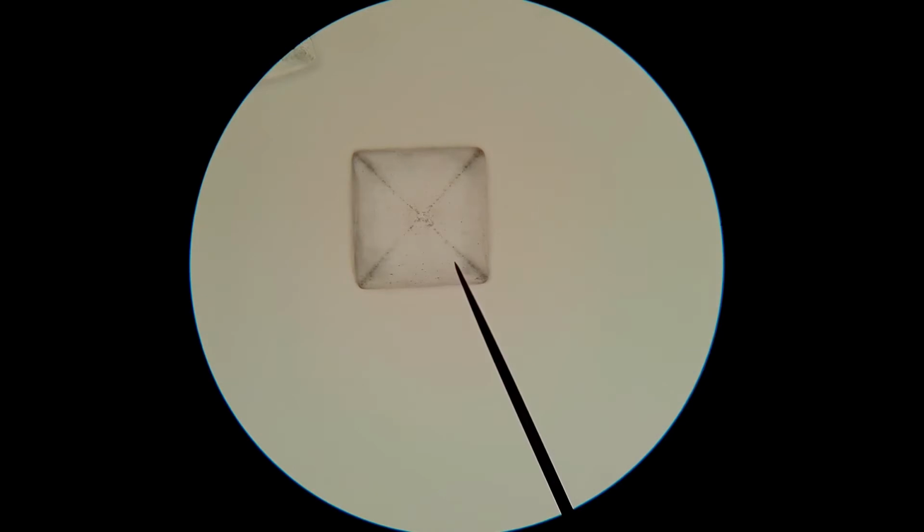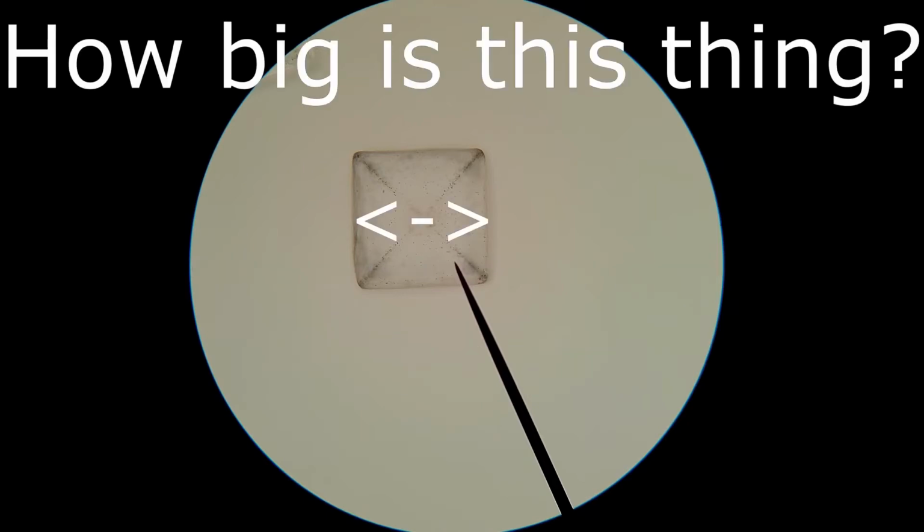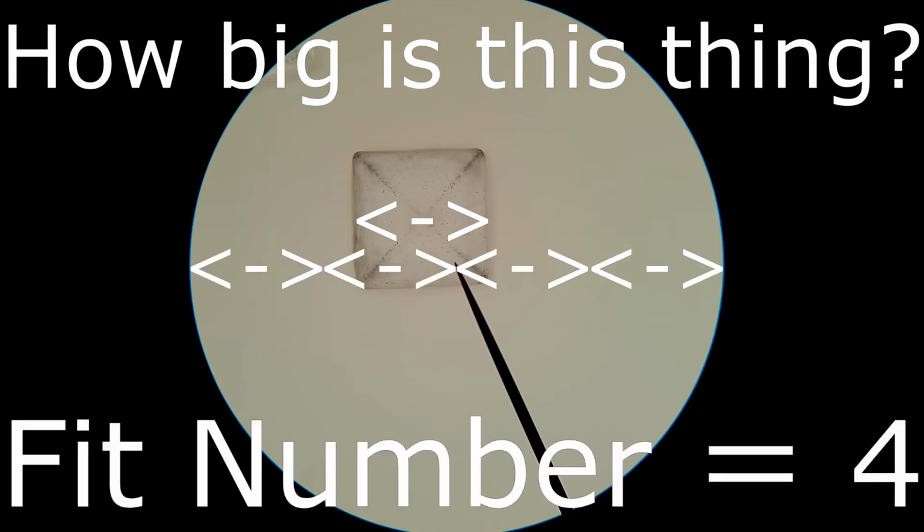For example, this is an image of a salt crystal under medium power magnification. That means our field diameter is approximately 1,720 micrometers. If we want to estimate the size of the salt crystal, we need the fit number of the salt crystal. How many of these salt crystals do you think could fit side by side in our field of view? When I look at the image, it appears to me that we might be able to fit about 4 of them across our field of view.